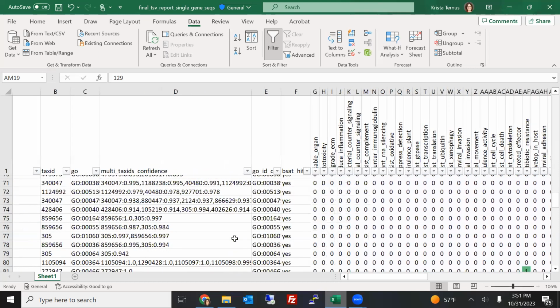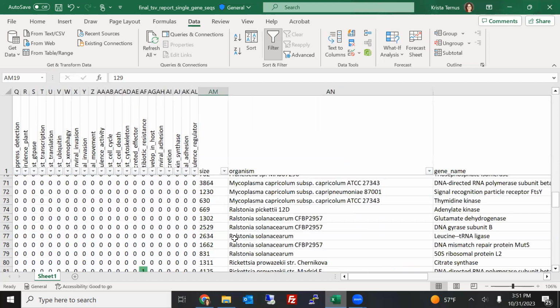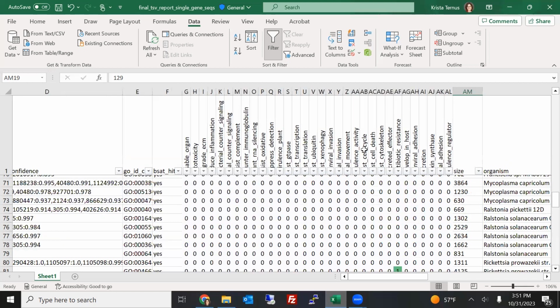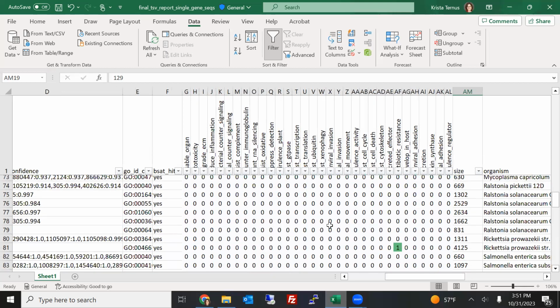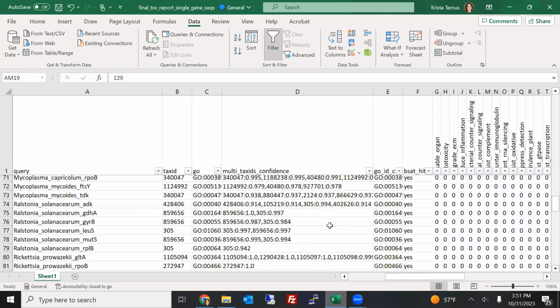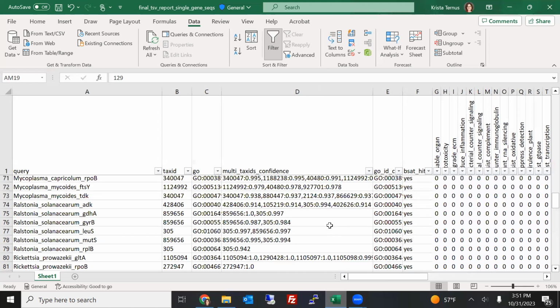And I think that's the majority of what I had to say, other than the machine learning process in SeqScreen is not run in real time. It's run ahead of time, and then we pre-populate our database with all of those results so that every time you run a query sequence through SeqScreen, you should get the same result. You shouldn't see different results each time.